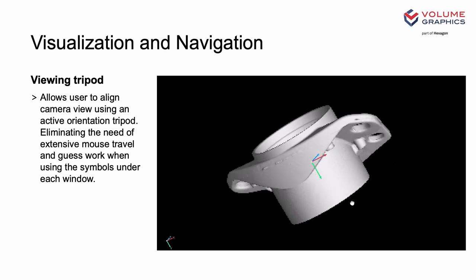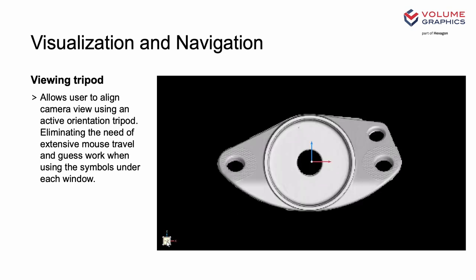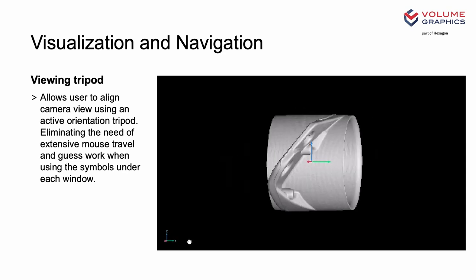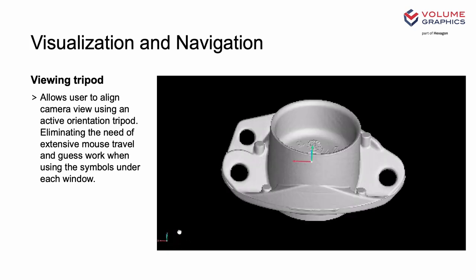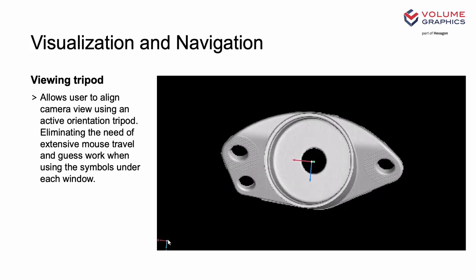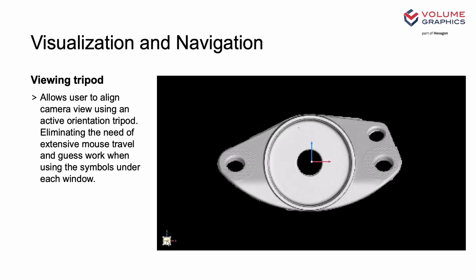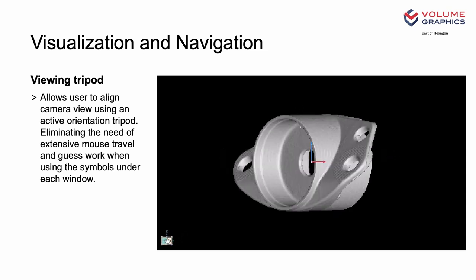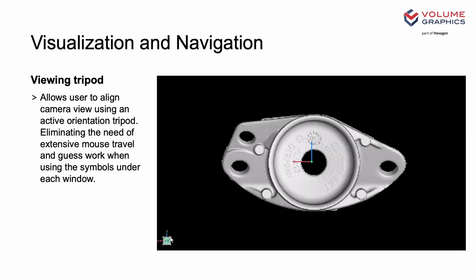First up, we're introducing the viewing tripod. If you keep an eye on the video, you can see that you can now use the tripod in the corner of the window to align the camera to the scene. As you hover the cursor over this tripod, you can select faces, or you could select vertices or even nodes to give you direct access to the fixed views, whether these be direct or oblique. This means that you can quickly get the camera to predefined, aligned views and eliminate the guesswork with using the little symbols at the bottom of the window.